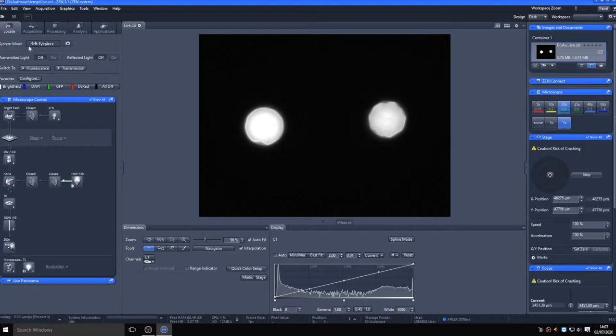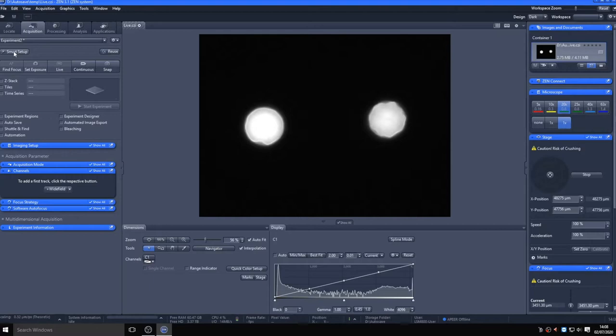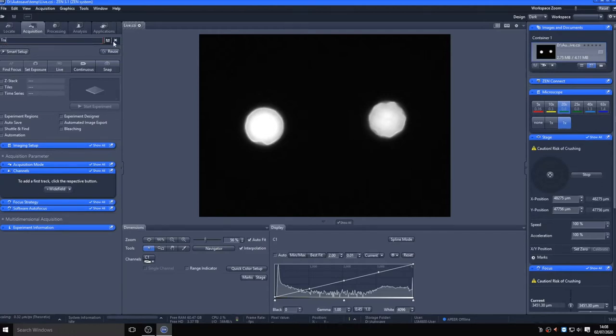Once you're happy with the sample in view, move over to the acquisition tab. This is where you set up the microscope for acquisition of digital images. The easiest way to do this is to use a smart setup to create an experimental design for yourself. First, create a new experiment with a suitable name, and then use the smart setup tool to set the microscope up for acquisition of the fluorophores present in your sample.